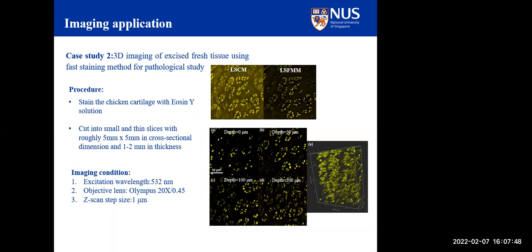You mentioned that different tissues and samples have different levels of scattering, and that can really affect what you can do with it. If you were coming to your scope with a completely new sample, is it likely that there would be quite a large period of troubleshooting and optimization before being able to get clear images?